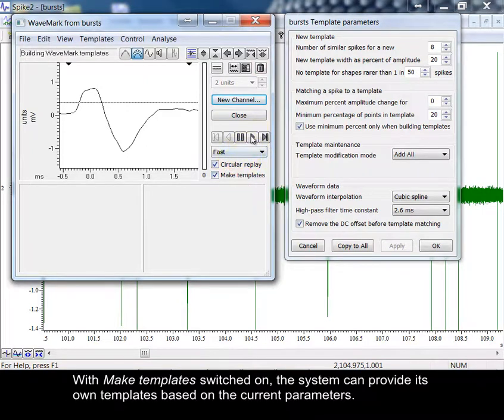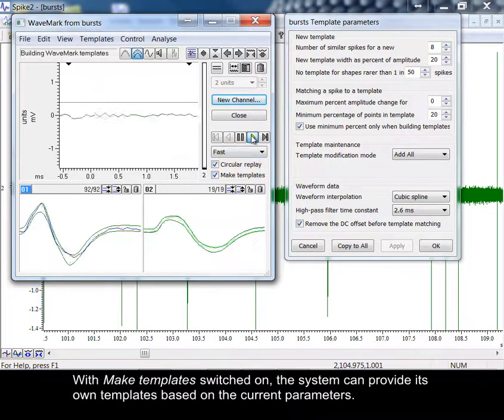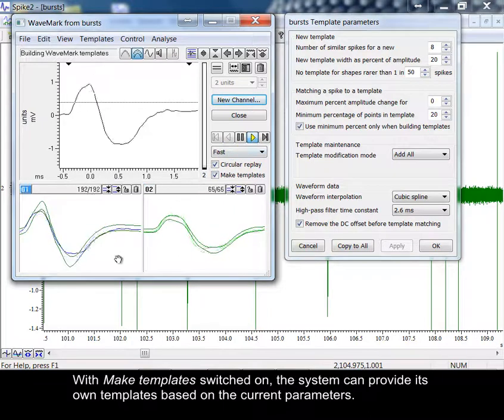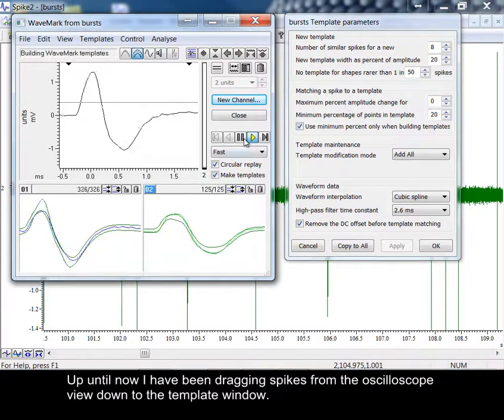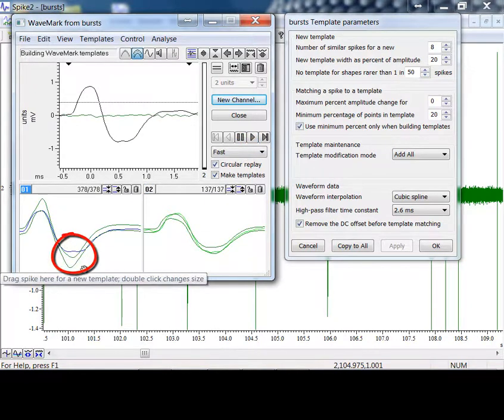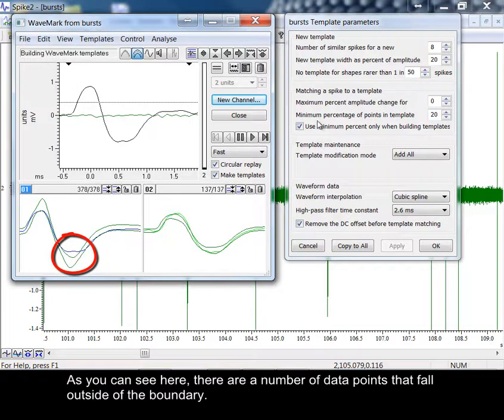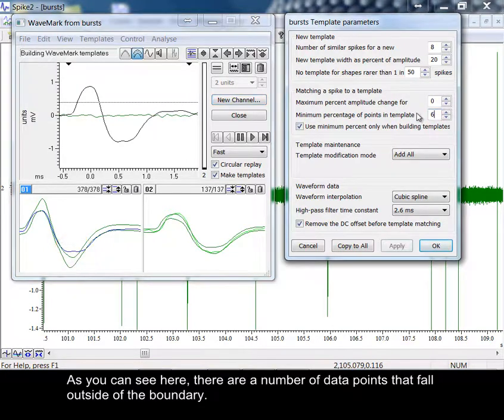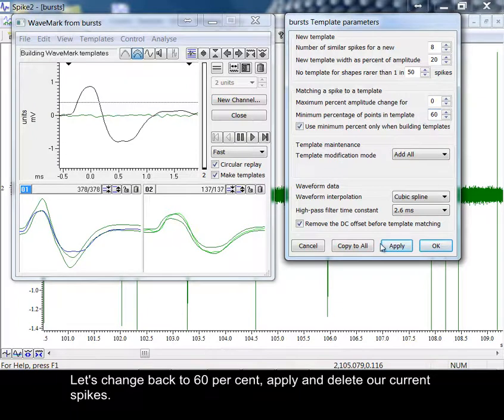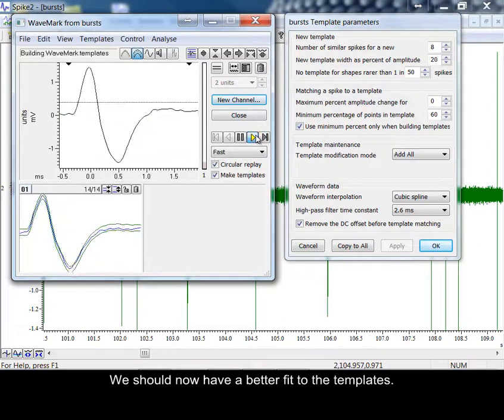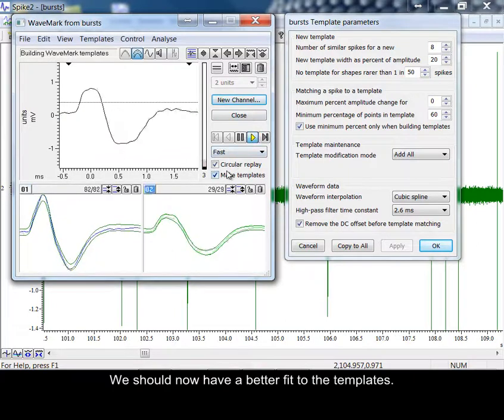With Make Templates switched on, the system can provide its own templates based on the current parameters. Up until now, I have been dragging spikes from the oscilloscope view down to the template window. As you can see here, there are a number of data points that fall outside of the boundary. Let's change back to 60%, apply, and delete our current spikes. We should now have a better fit to the templates.